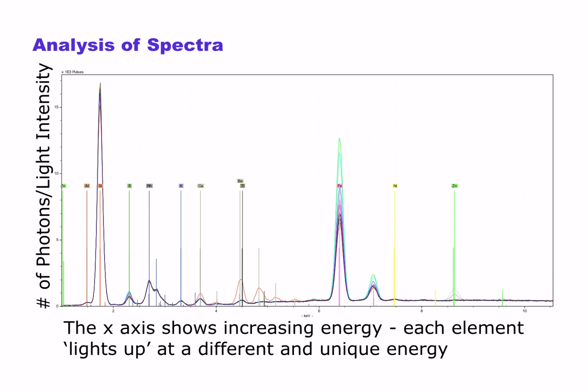Looking further to the left, you see that red mountain range. Those are multiple characteristic peaks of barium. This is barium fluorescing from the L orbital. Because there's more electrons there, there's a lot of different possible electron-electron interactions. As a consequence, rather than getting 2 distinctive peaks, we get about 9, though usually only 3 or 4 are going to be easily visible in the spectrum.